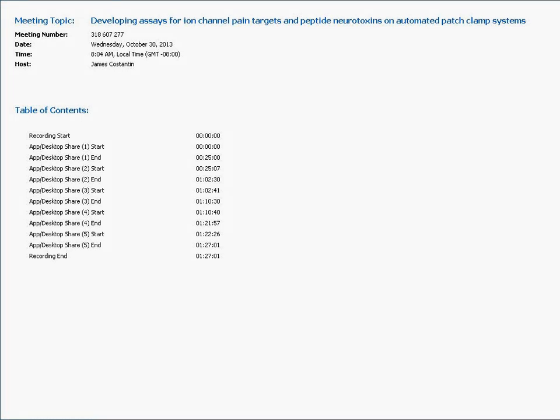And the next derivative we tried, you can see here, it didn't inhibit as well, but it still did a pretty good job of inhibiting the current. So again, it's the same layout. The red is vehicle, yellow is 1 micromolar, and so on and so forth. It's actually 6.25 micromolar. And you see that it inhibits the current pretty well.